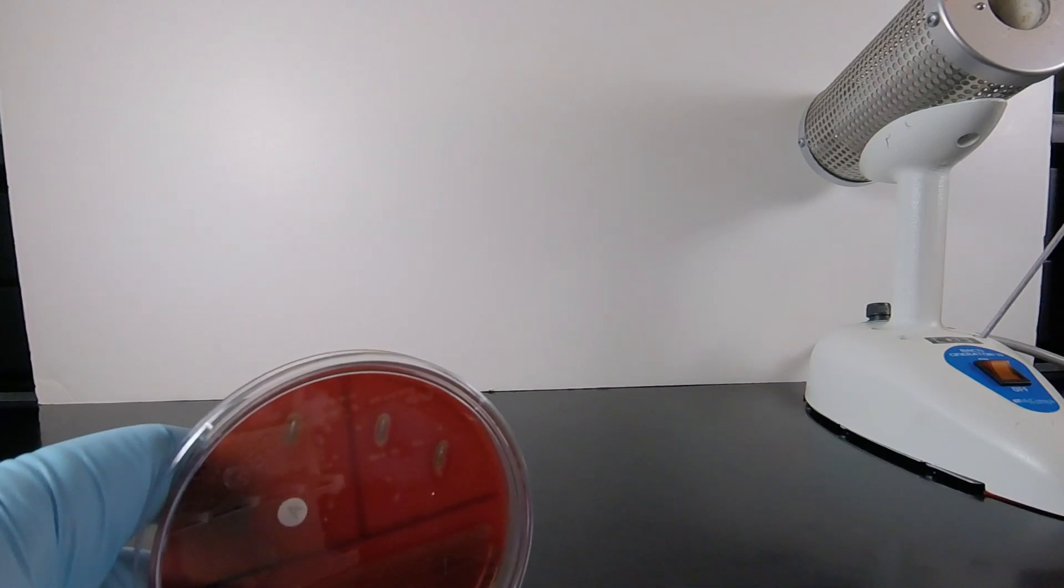In a previous video lesson, we learned how to streak a blood agar plate and place on a Taxo A disk containing the antibiotic bacitracin.